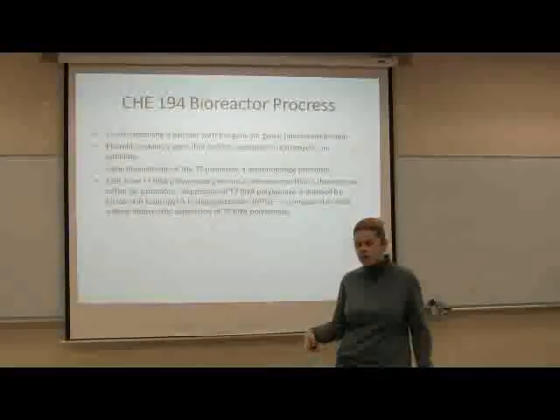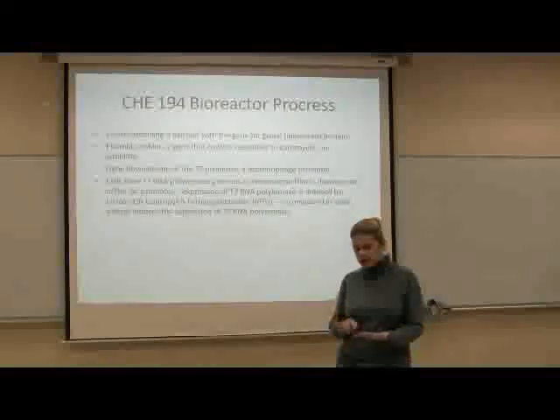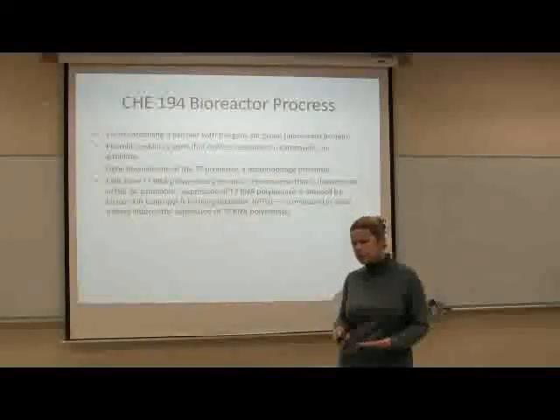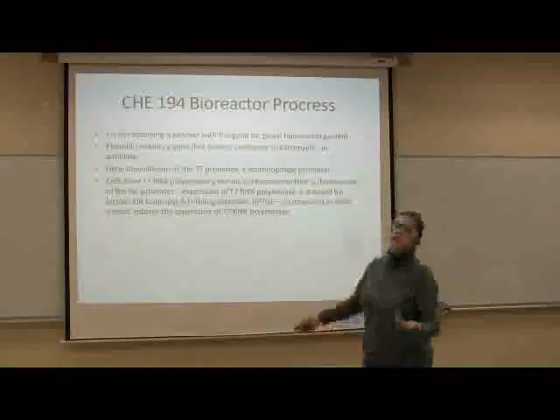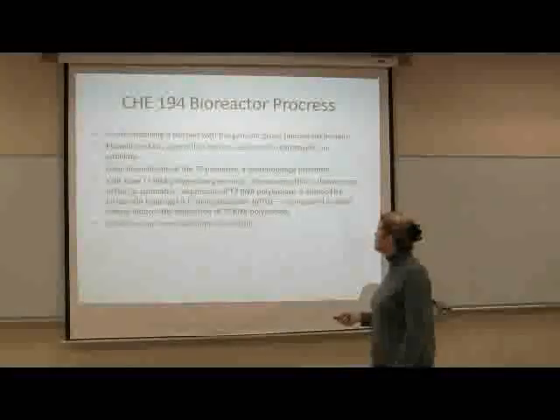Whatever it is, this produces in our system without adding any inducer. It must be either in the tryptone or the yeast extract. There must be something that causes this induction to happen. So we don't need to worry about it. That's all it is. Okay.